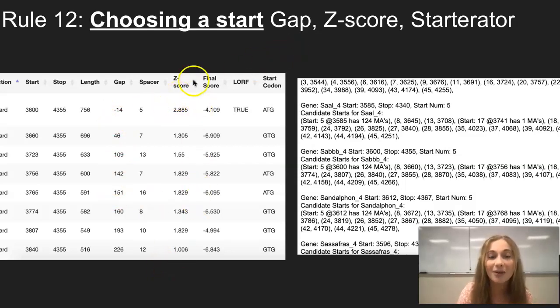And for z-score in this column, we are looking for the number closest to 2, whether it's a little bit under or a little bit over. So in this example, the 1.829 would be the best option compared to the 1.006 option because it's the closest to 2 out of all of these.